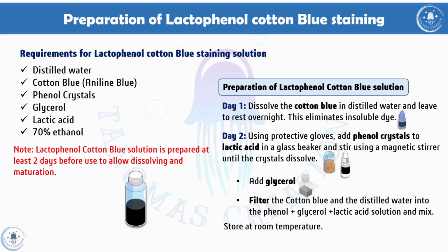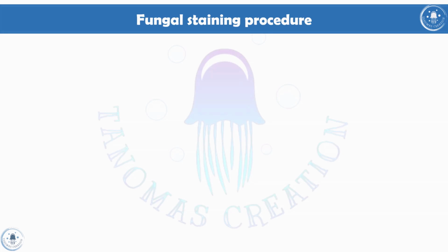Now the result will look somewhat like this. This is lactophenol cotton blue solution. So this is how the cotton blue solution is made, two days before. Now after making it, we'll come to the procedure.